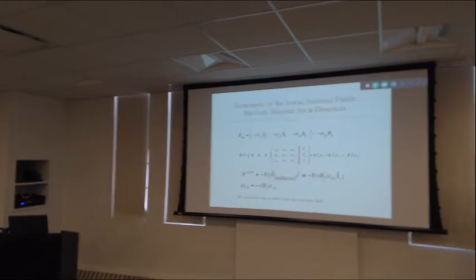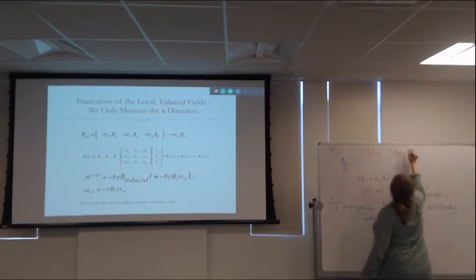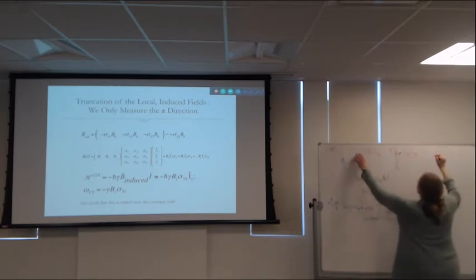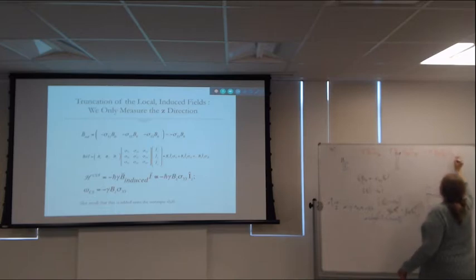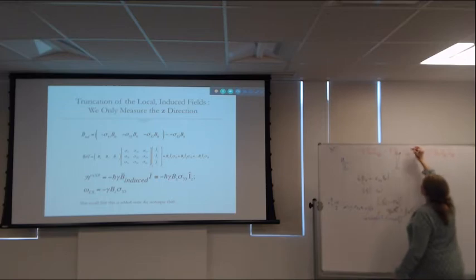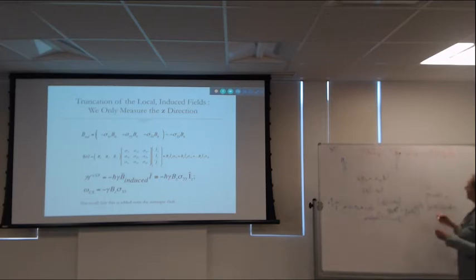That's just Zeeman. And if you're doing solution NMR, it might be gamma B naught sigma iso IZ. And then the third term that we're adding here for solids is, if it's anisotropic, you figure out what the shielding tensor's 3,3 value is. These are all operators, operator IZ. This is a scalar because it's just a component of the vector B naught. So we need an arrow.